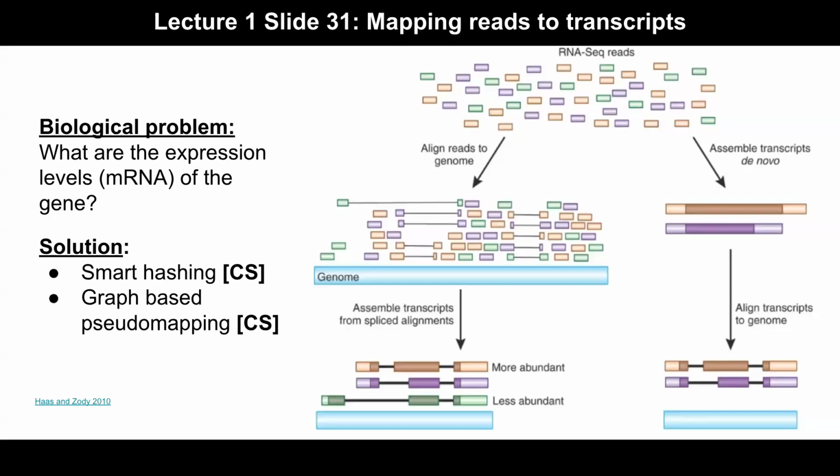Okay, so just to preview what we've been talking about and what we're going to talk about. In one of the first lectures, I'd shown you this figure where we had motivated what the problem is about. The idea behind doing RNA-seq is you want to quantify where exactly the gene is being expressed. And while this is a pure biological question, to answer this, and hopefully you'll appreciate the technological advancements that we have to do to be able to measure gene expression. Last week we were talking about DNA-seq, where we were just sequencing the genome. Now we are talking about sequencing the copies of mRNA or the isoforms that are expressed.